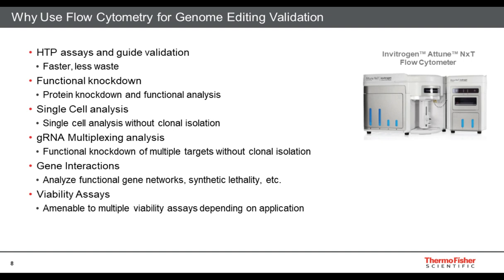Another added benefit is it actually gives you the functional knockdown. So all of these other methods previously described are looking at the genomics, looking at the actual edit on the genome, which, as we know, an edit does not always confer knockdown. So that's very important.